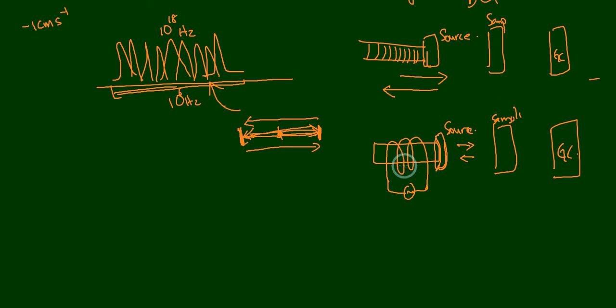Here it is a much more complicated setup, but it is easier when we are using a loudspeaker coil and giving a particular AC frequency. Then this will move forward and backward at different velocities, and the multi-channel computer will detect the velocity at every position, and also take the reading from the Geiger counter.